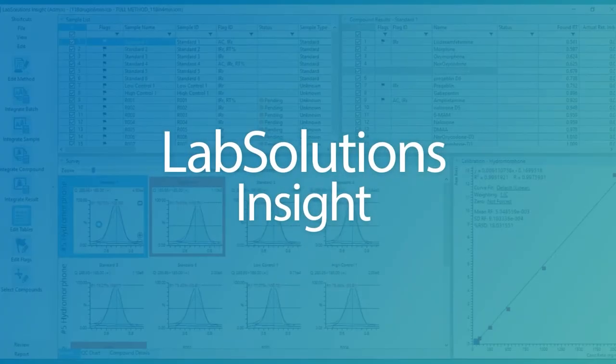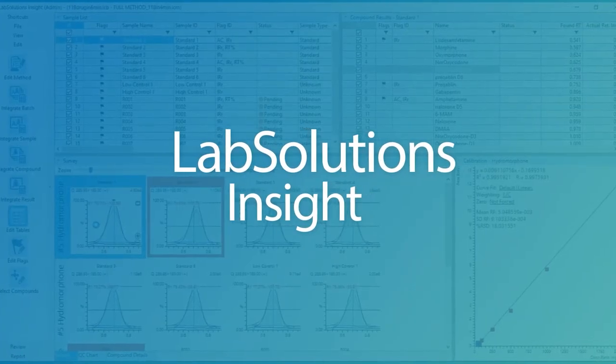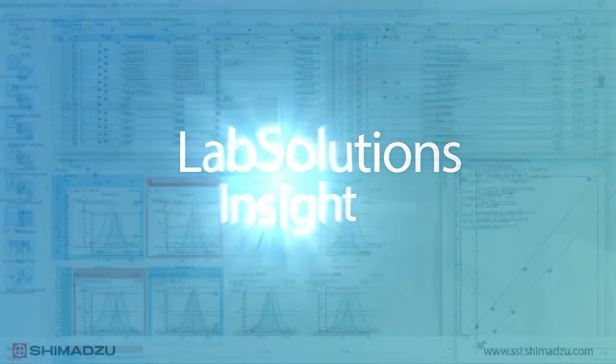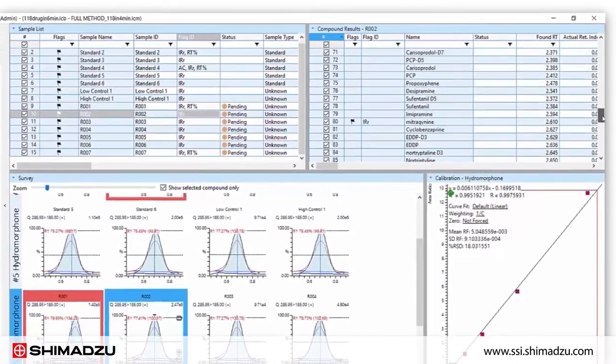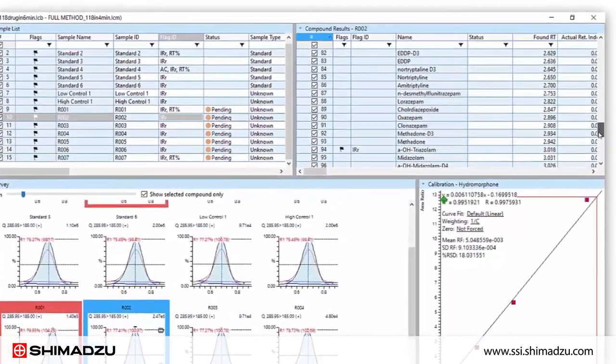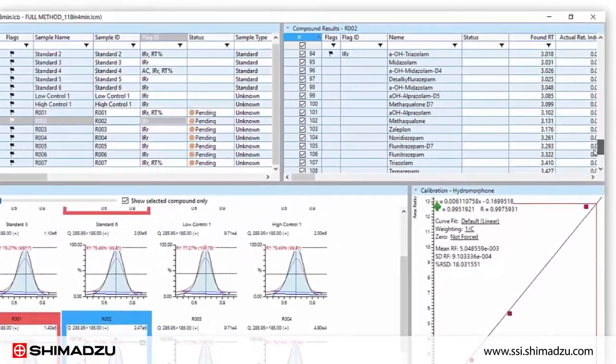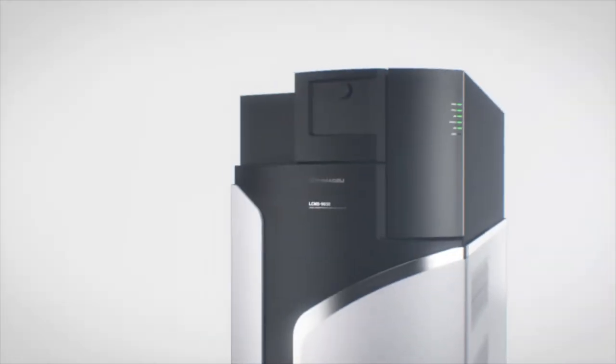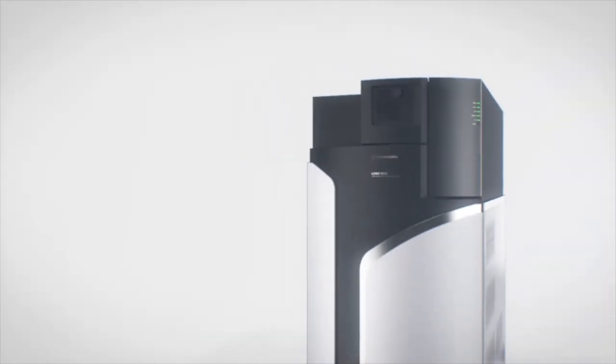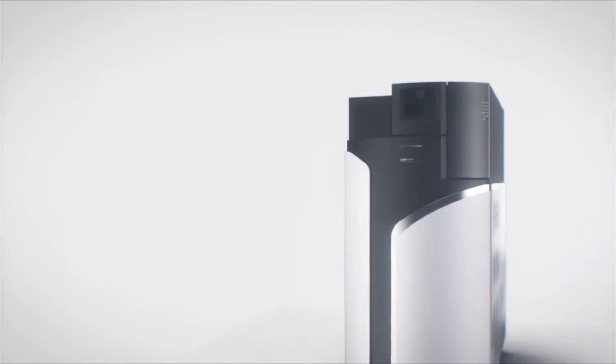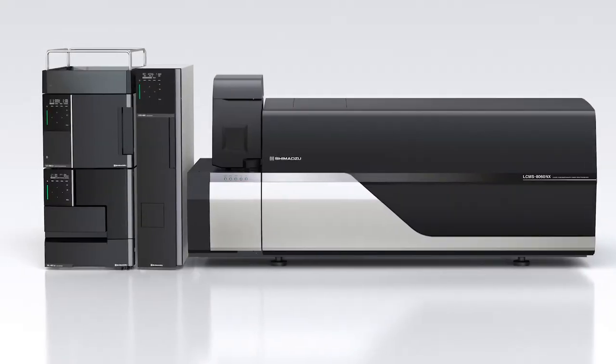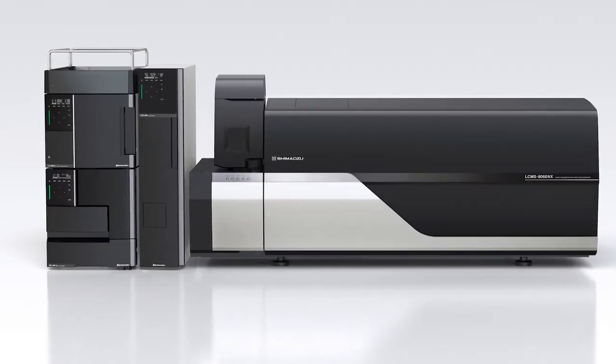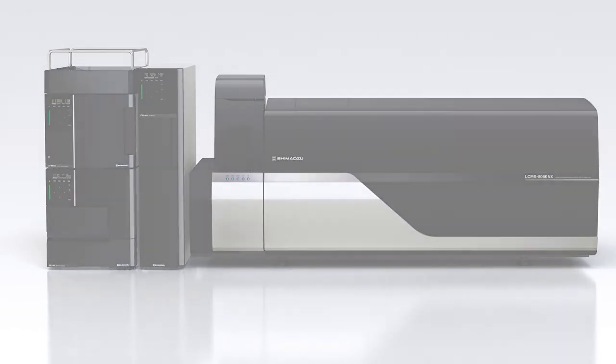Today I will be demonstrating a targeted screening method using library verification within LabSolutions Insight Explore software. This specific example will be utilizing a Shimadzu QTOF but could be similarly applied to any Shimadzu triple quadrupole instrument.